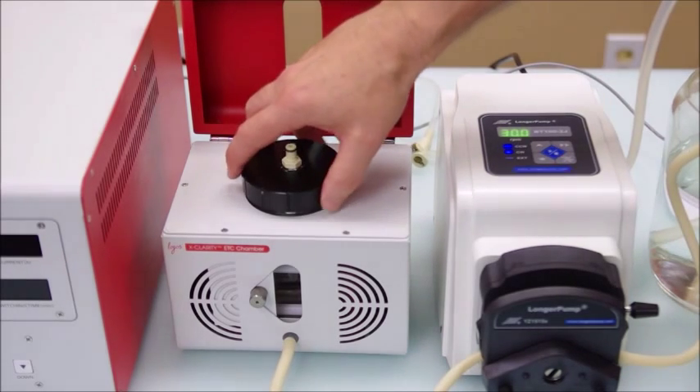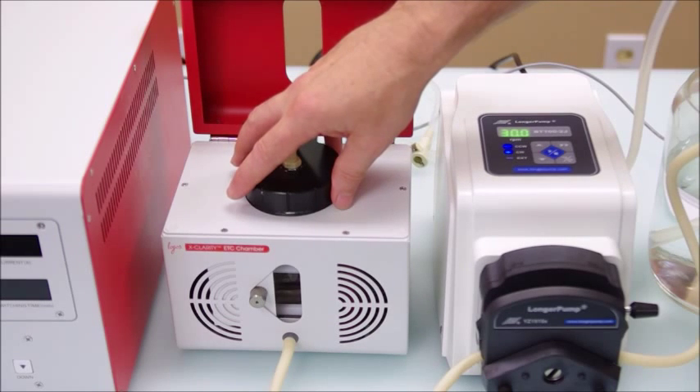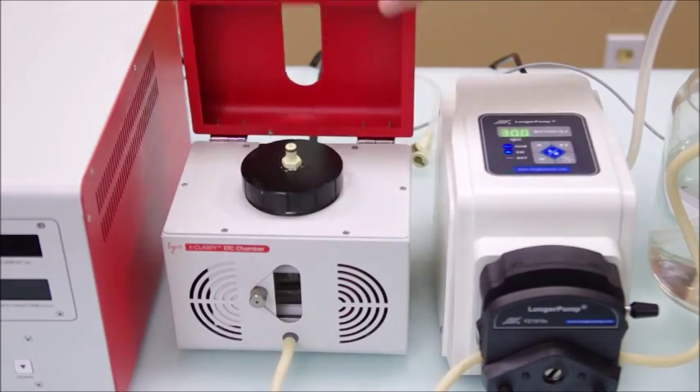Then third, prior to filling and draining the chamber, make sure that the lid cap is firmly in place, the quick lock is secure, and both tubes are connected.